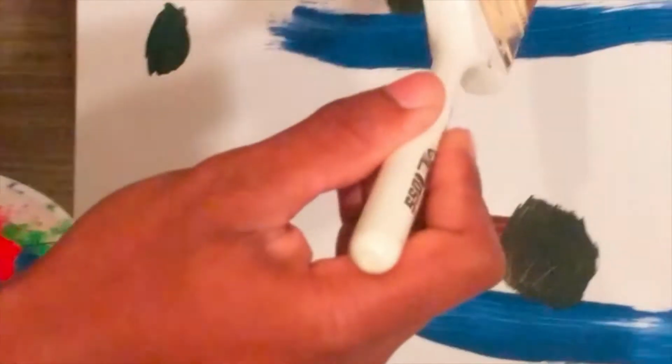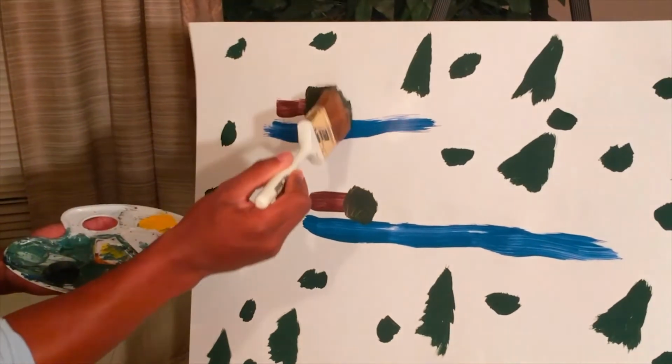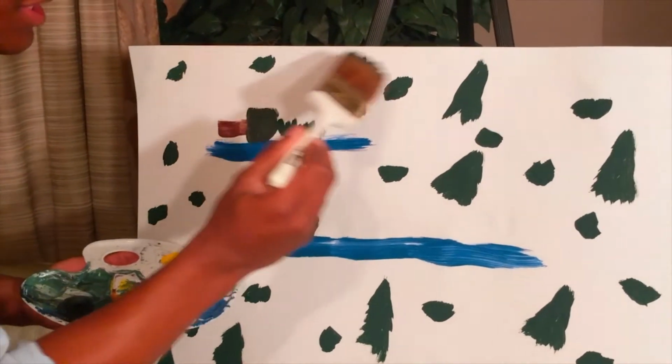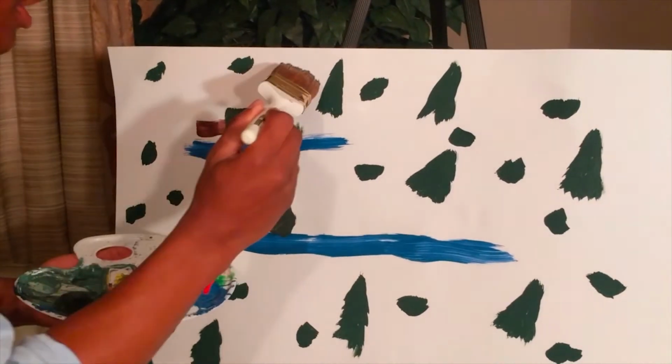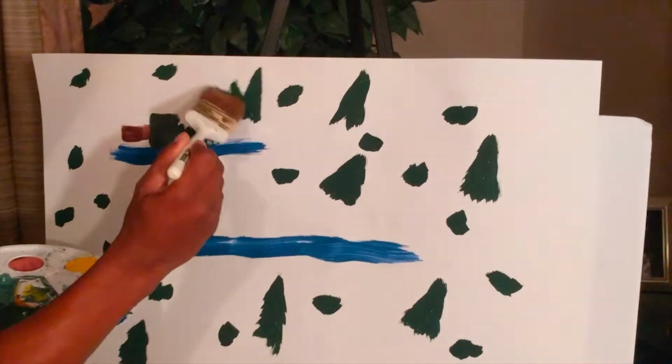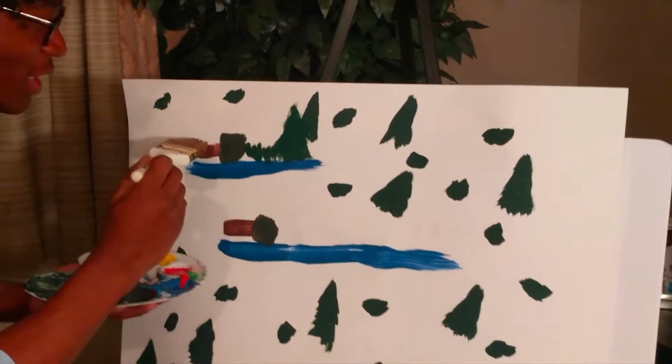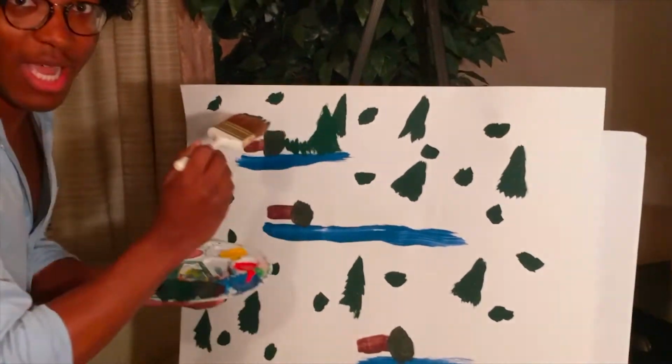Now we're going to use our 2-inch brush, and as the polymerase goes on, it's going to add in the dNTPs, because you know we've got a lot of these little duders right here. It's going to keep on adding till eventually one of these ddNTPs is going to come in. We're going to draw this a big old tree, a nice big old tree right here. The beauty of the ddNTP is the polymerase can't go past it. It'll just stop right there.